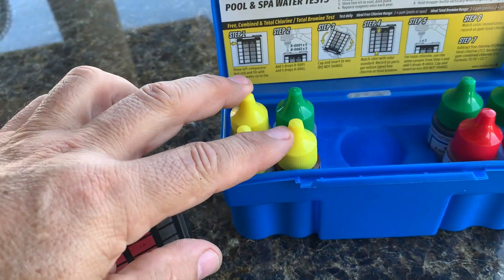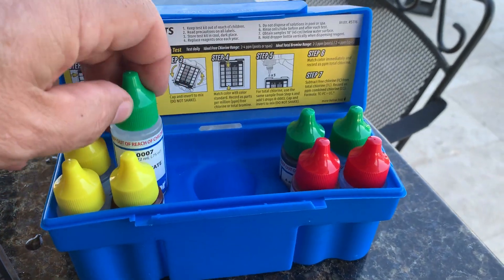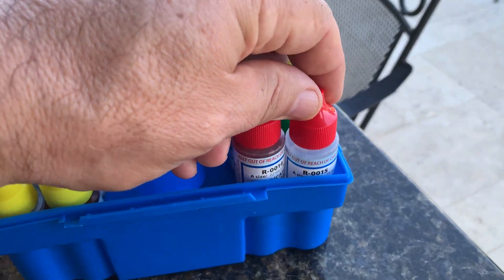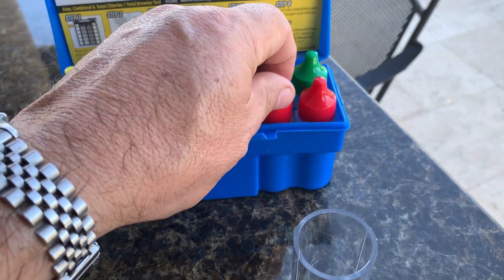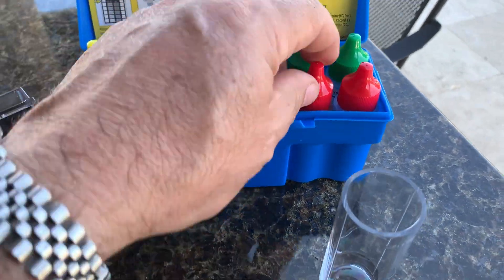It'll do the total chlorine and the free chlorine using these three yellow caps here, and then for your alkalinity you're going to use these green ones, and for your pH and your acid demand. After you check your pH, you can actually do another test to figure out how much acid you need to bring it to your desired pH level.